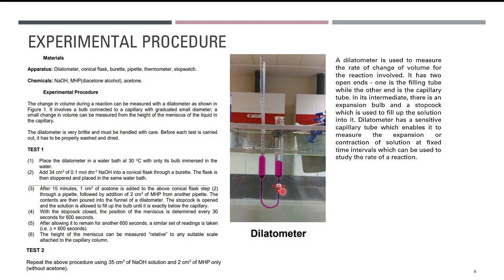You want to fill up first, so you open up the tap, but as soon as it has filled into the bulb, you close, and then you will watch the volume rise via capillary reaction.